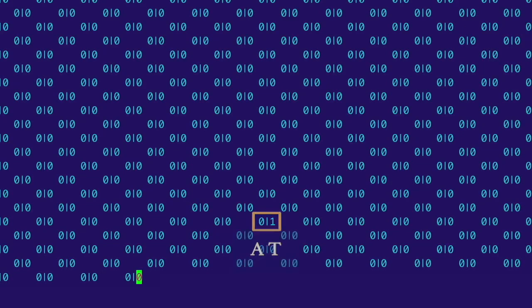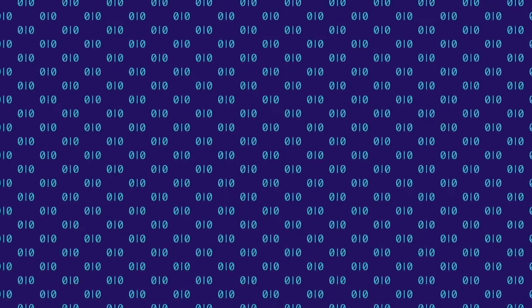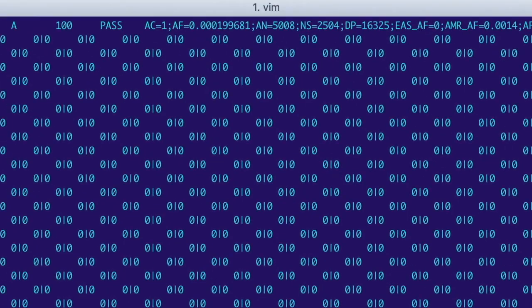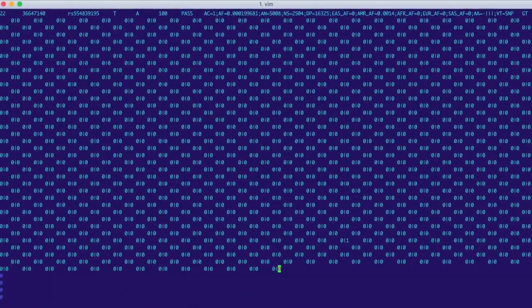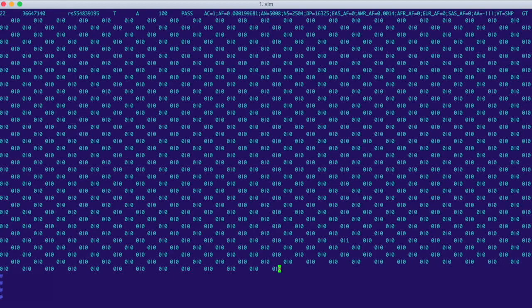If we scroll down, we can see that the VCF file continues like this.